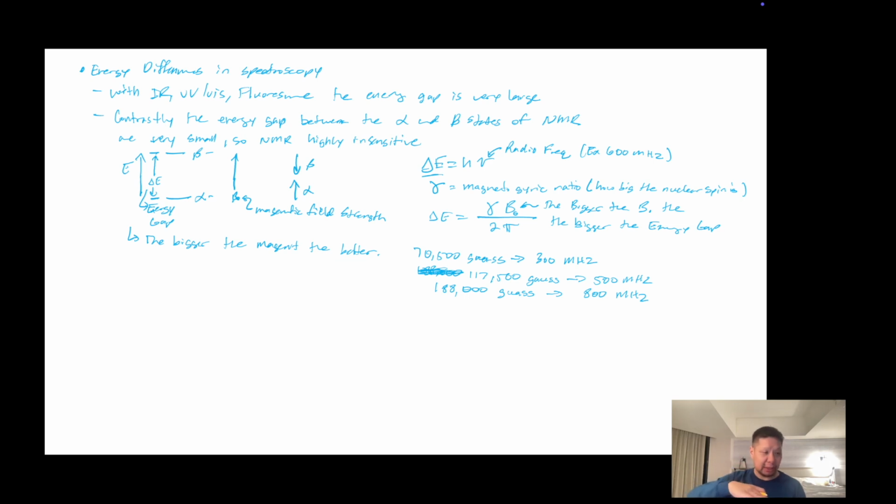If you don't, you'll have different readings for every part of your sample, even though it's supposed to be a homogeneous mixture. The best magnets there are now are around $10 million, and they're running at 1.2 gigahertz, or 1,200 megahertz. So they're really high field instruments.